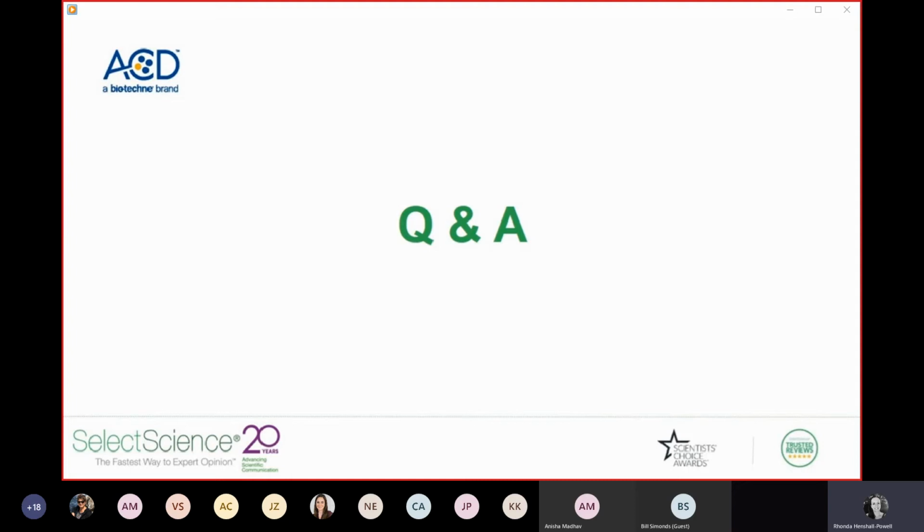Great, thank you both. The next question we have here: how do you quantify high and low levels of mRNA expression, which can differentiate between different types of neurons?